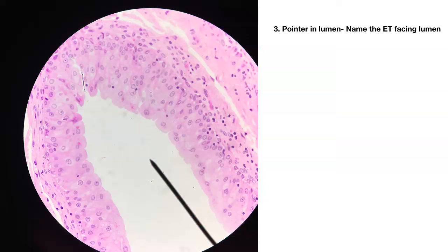Number three. Pointer in the lumen. Name the epithelial tissue facing the lumen — look real close at those apical cells. That was just a hint; you won't be getting any hints on an exam.